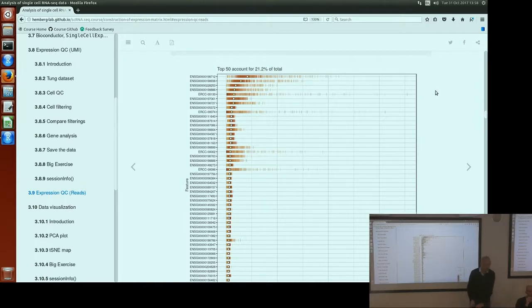Maybe you're right. And also, it's well known that for mRNAs, the variability is proportional to the mean expression level. So highly expressed species will have higher variance. That's just what you expect to see. So that's why this happens as well. So the question is, is the reason for that because ERCCs are shorter than mRNAs? I don't think so, because ERCCs are not mRNAs of the organism, so it doesn't really matter whether they're short or not. Shouldn't matter, at least. But I'm not sure.